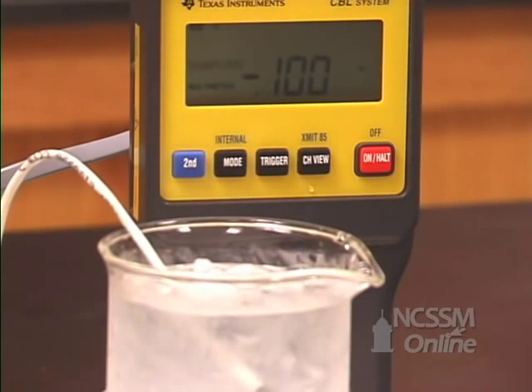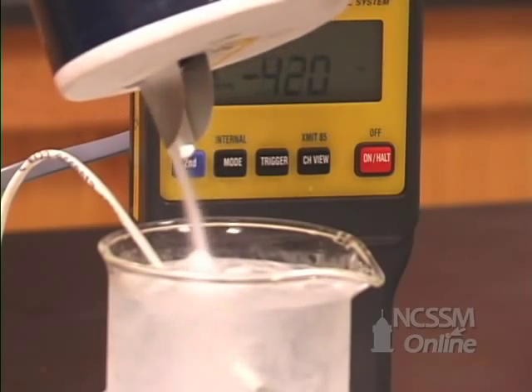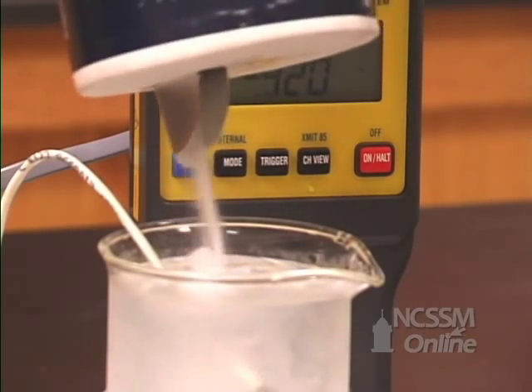We have a CBL to act as our thermometer, so it's reading the temperature of this ice water bath. I hope you can see the decimal right there — it's actually 0.1 degrees Celsius. What I want you to do is observe what happens when we add salt to our solution.